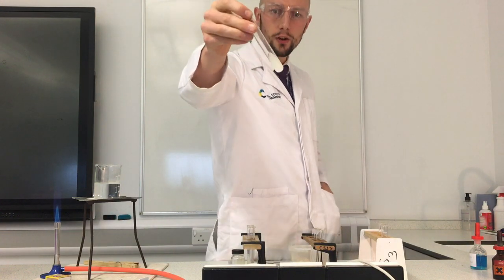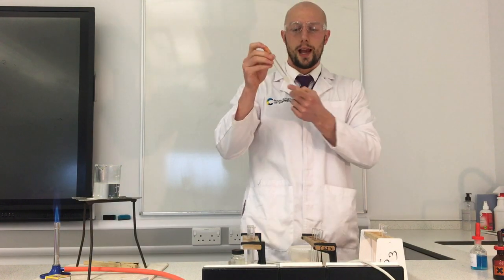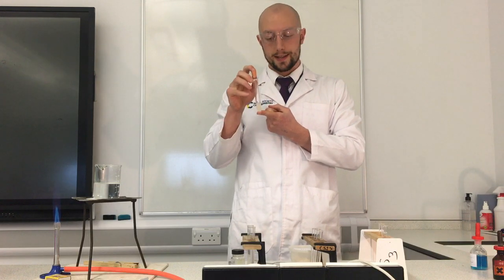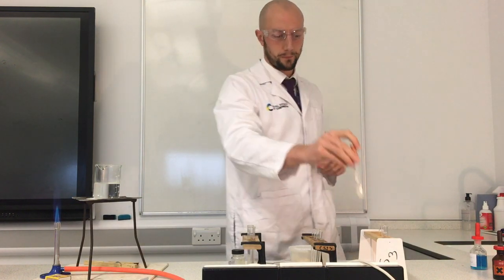If we look at this, it's gone a little bit cloudy, but it's not cloudy enough, so I know that there isn't any fat in it.